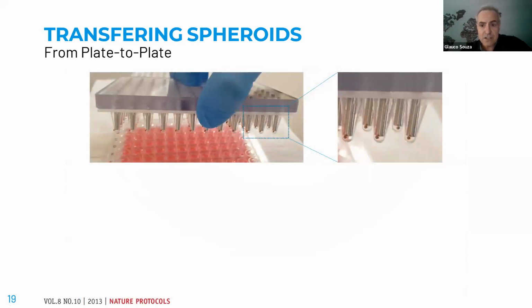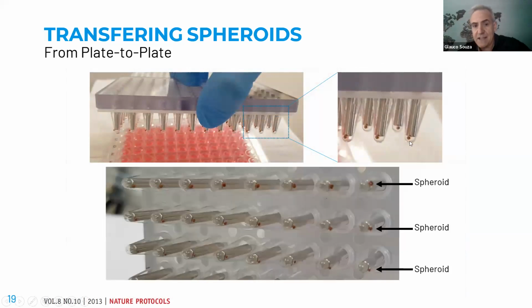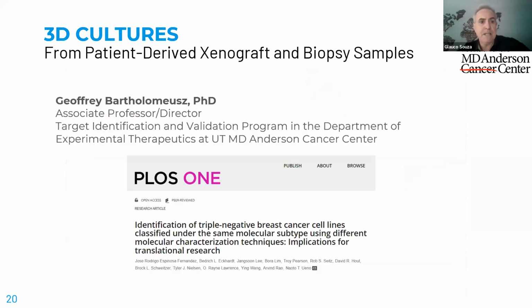And here is a real result. This is not a drawing. That was a cartoon, but these are the spheroids right on the side there when you pick them up with the MagPen.